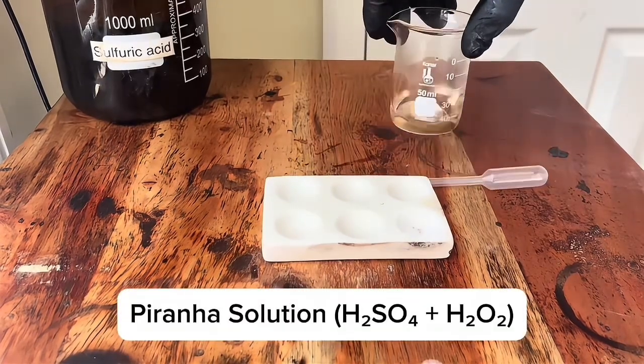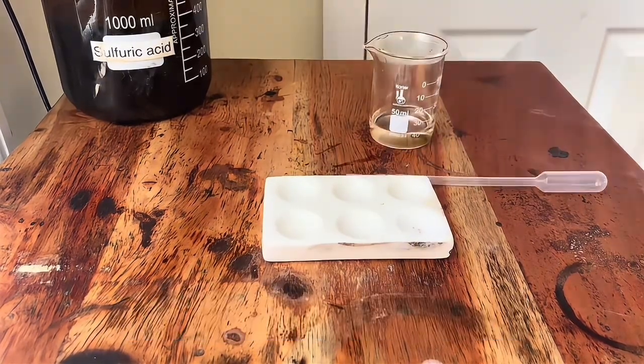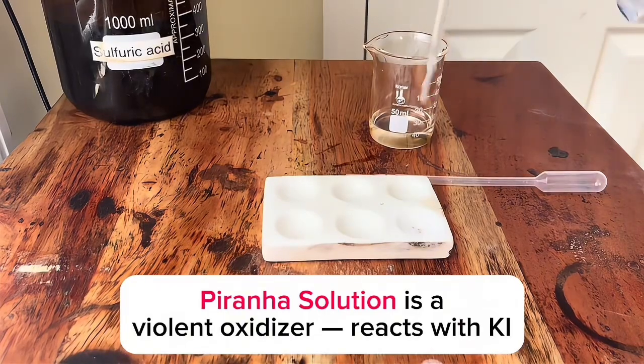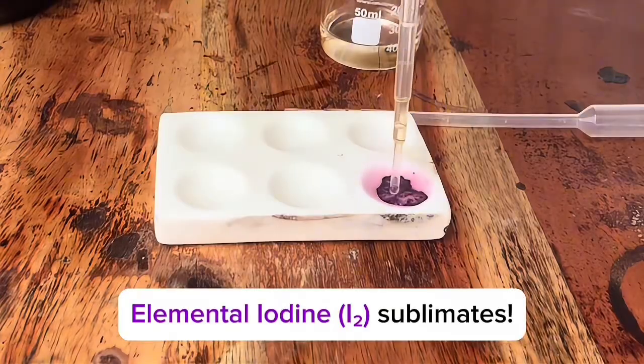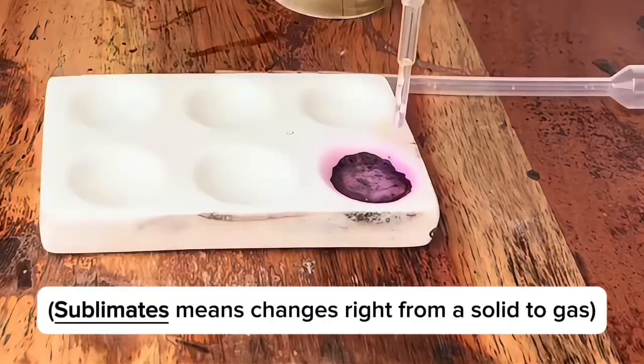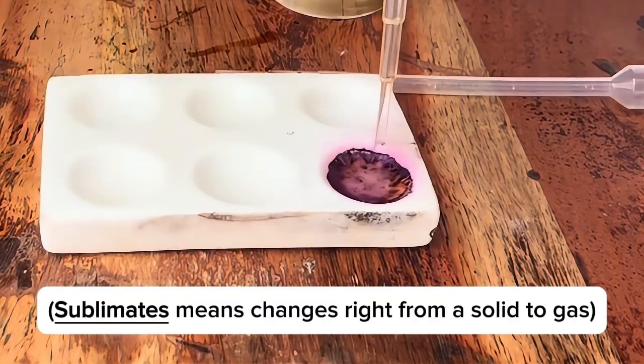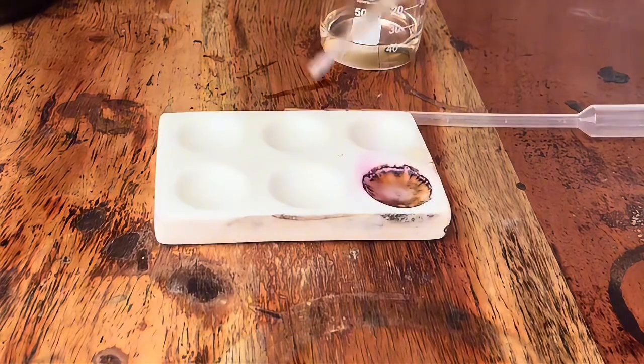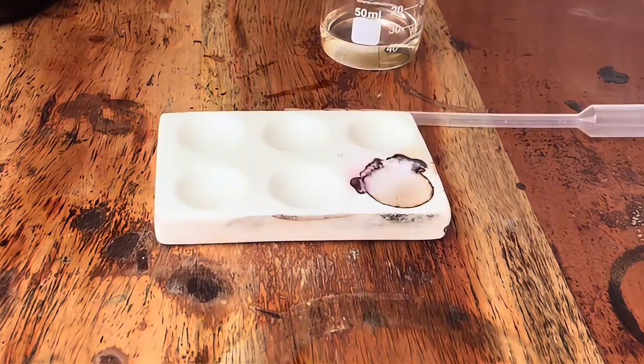Now I have some piranha solution. Piranha solution is a violent oxidizer and it reacts with the potassium iodide to make elemental iodine. Those purple vapors are elemental iodine. As I add more piranha solution, it further reacts with the iodine to make iodate.